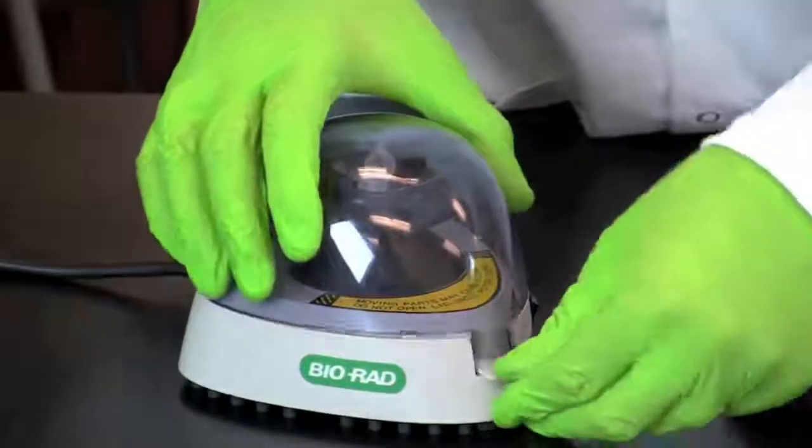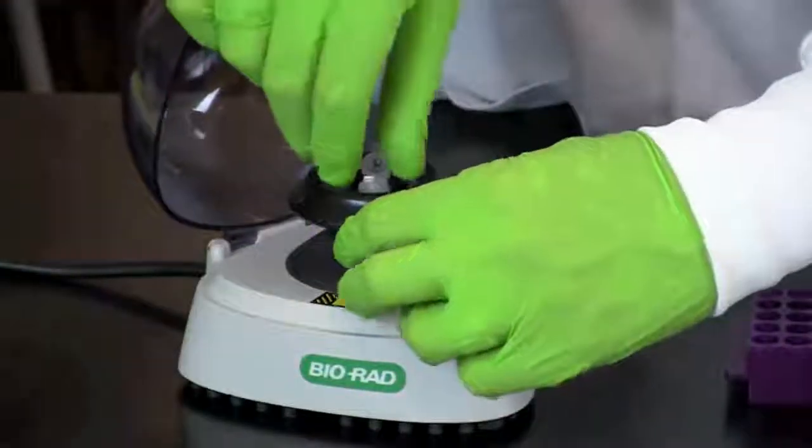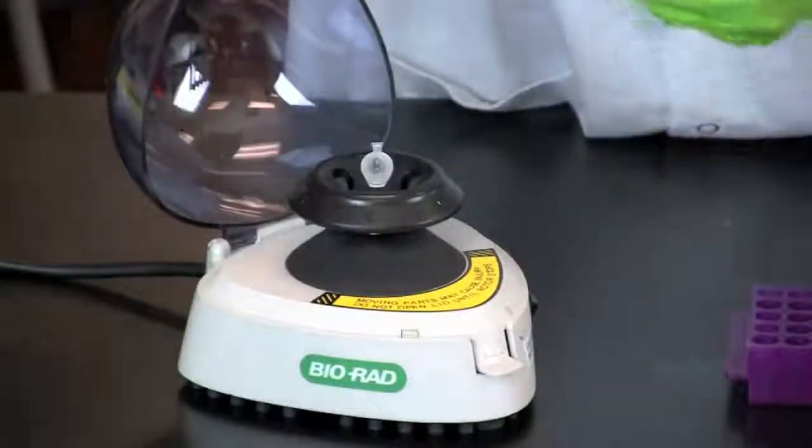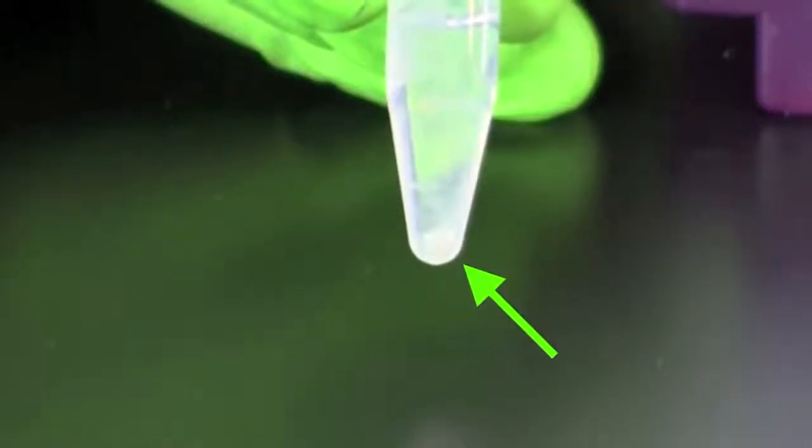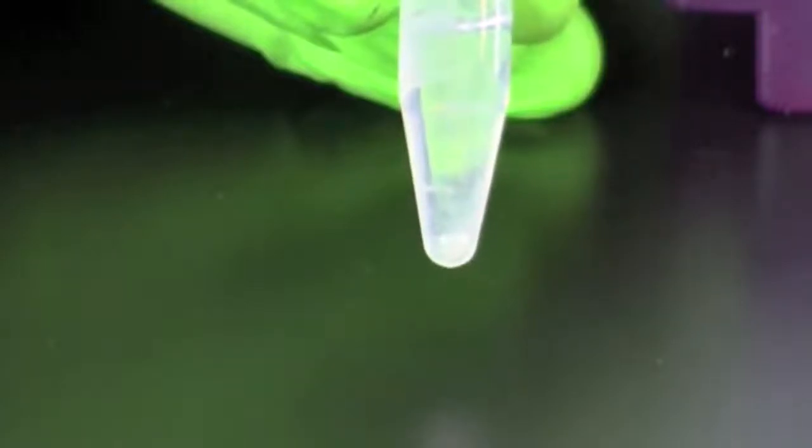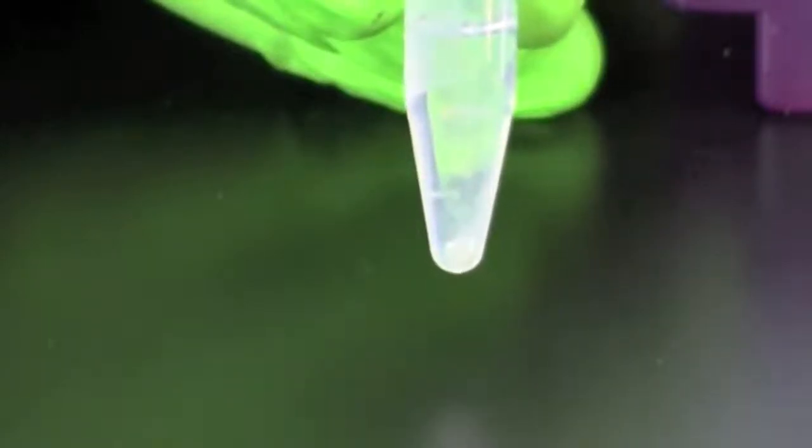Locate the cell pellet. The pellet should be white and be the size of a match head. If the pellet is smaller than a match head, remove the supernatant, add another 1 milliliter of mouth rinse to the same tube, and repeat the centrifugation.